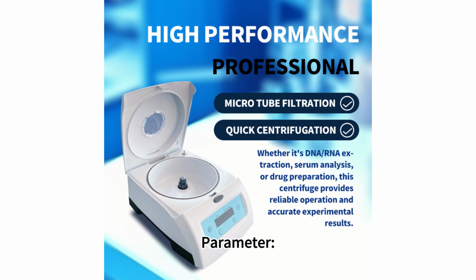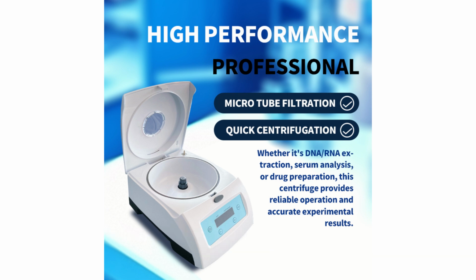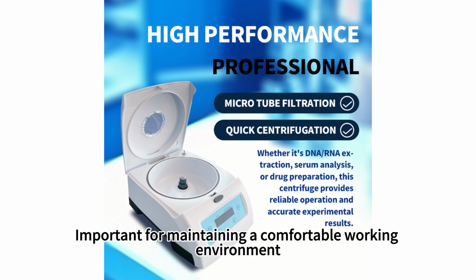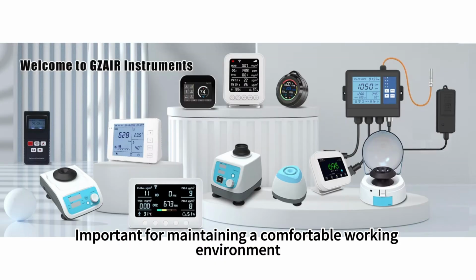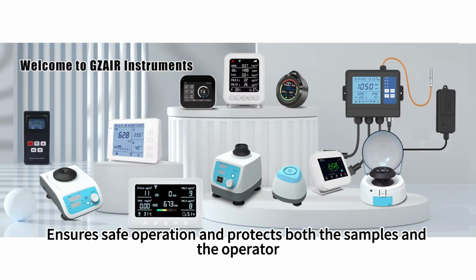Noise level. Parameter: describes the decibel, dB, level of the centrifuge during operation. Importance: important for maintaining a comfortable working environment. Safety features. Parameter: includes safety locks, alarms, and automatic shutoff mechanisms. Importance: ensures safe operation and protects both the samples and the operator.